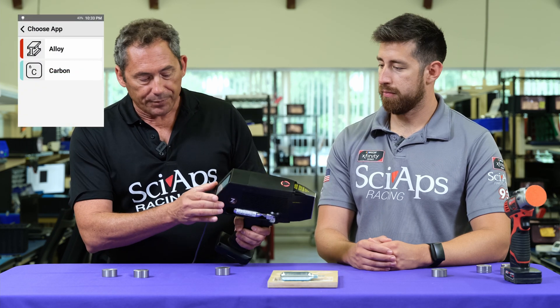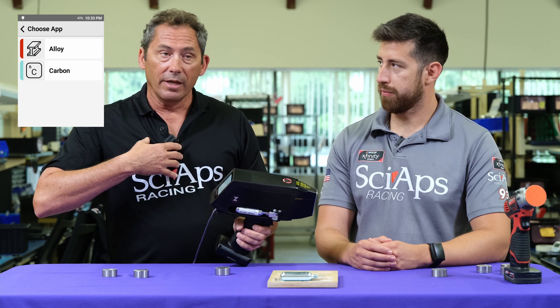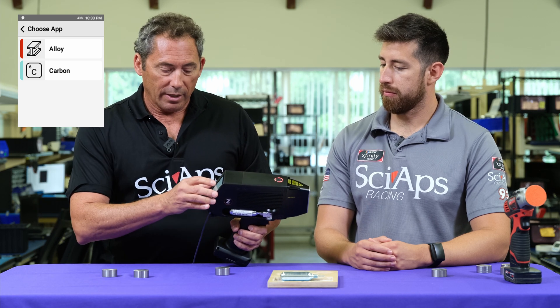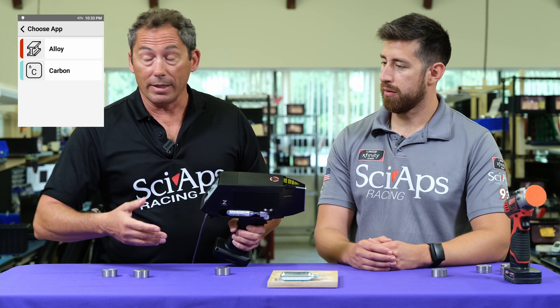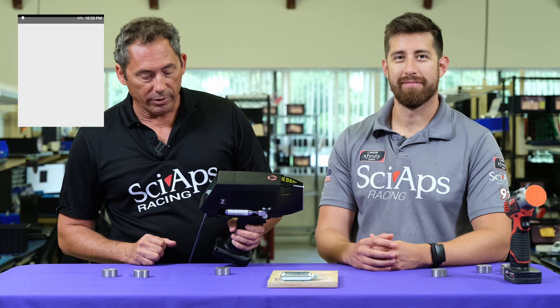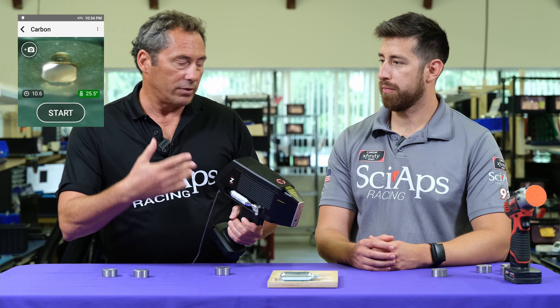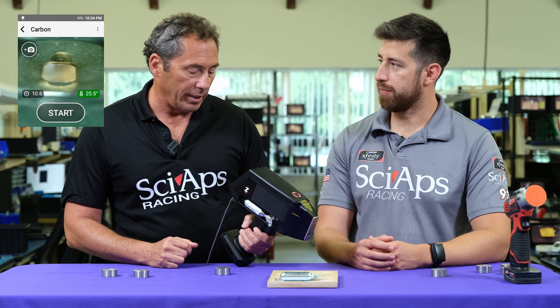So you fire this thing up, and you have two choices: you can do alloys or carbon. When you do carbon, it does the alloy as well. But some users may not need a carbon test that day, so they would just choose alloy. We'll do carbon. It fires up and it's preset to do a pre-burn and to do several tests in a row, just like OES.